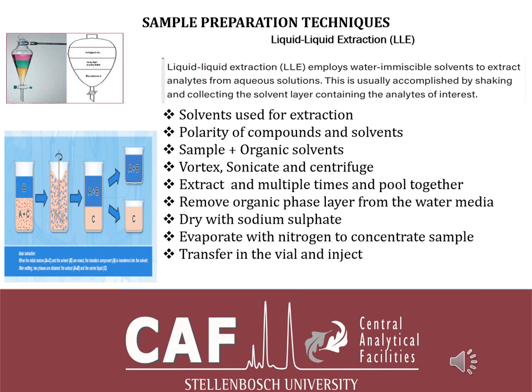So you can just release depending on where your organic solvent sits. It is also important to consider the polarity of your compounds of interest. I always say it is important to match the polarity of your compounds of interest with the polarity of the solvent. If you're working with polar compounds, you obviously have to use a polar solvent to extract them, because if you use a non-polar solvent, you're not going to get the polar compounds in it. It makes sense to consider the polarity.